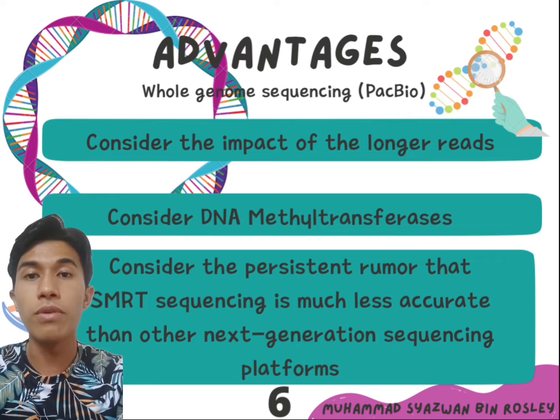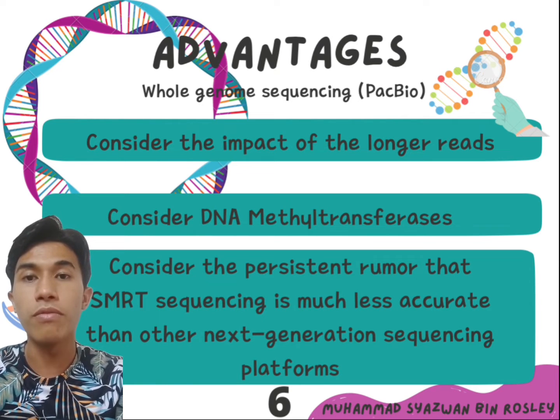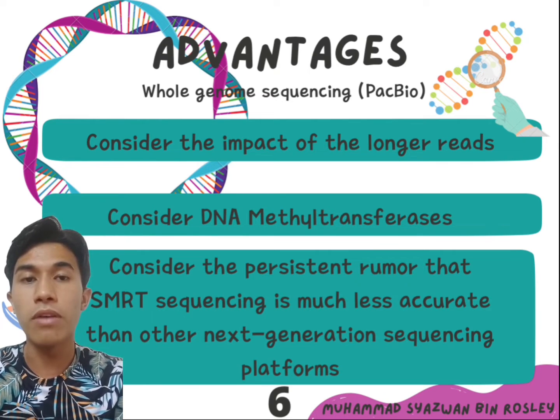First, consider the influence of longer reads, particularly for novel genome assembly. While traditional next generation sequencing can give extensive genome coverage, short read lengths and amplification biases might result in fragmented assemblies when a complex, repetitive, or poorly amplified region is encountered. As a result, GC-rich and GC-poor regions are particularly prone to poor quality sequencing.